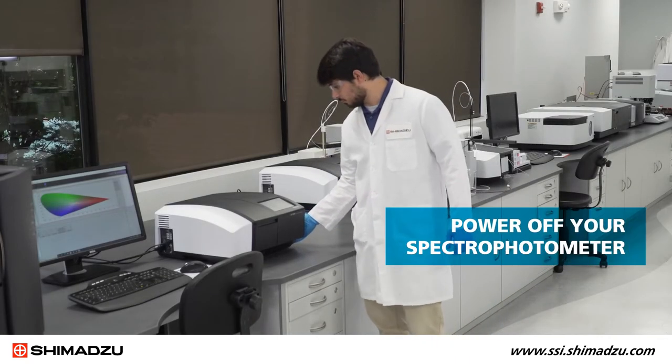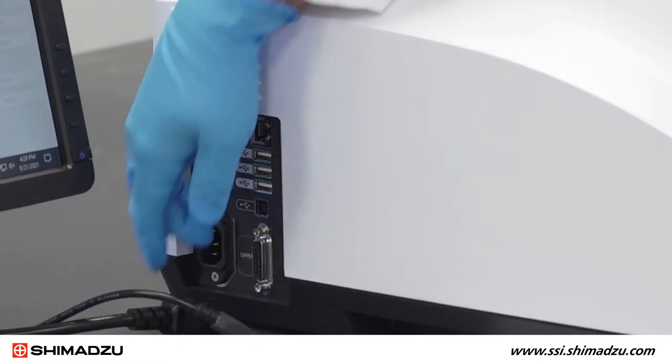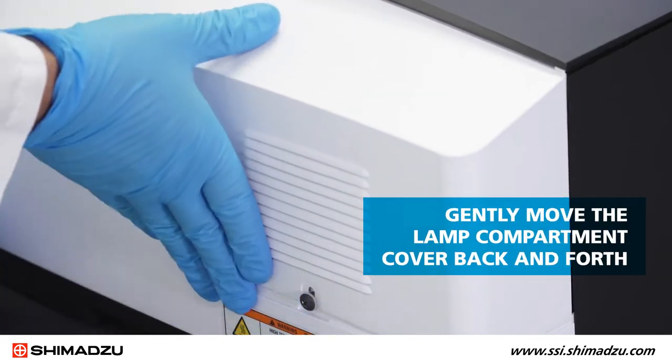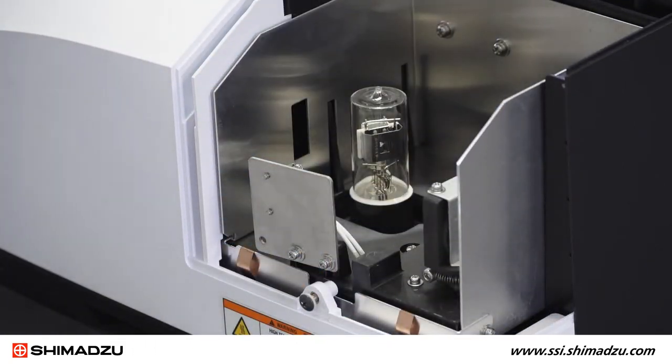Start by powering off your spectrophotometer and removing the power cable. Using the Phillips screwdriver, loosen the screw that secures the lamp compartment cover. Gently move the lamp compartment cover back and forth to free it from the main body of the instrument.